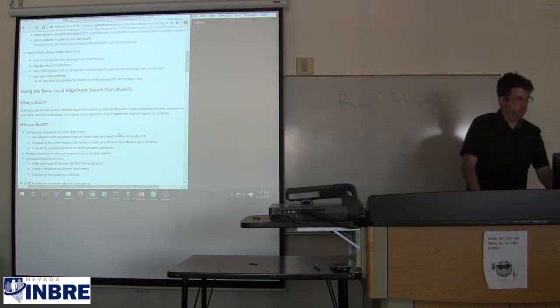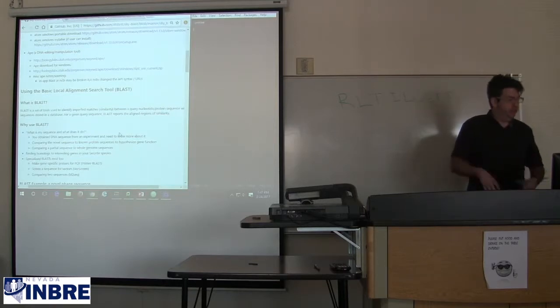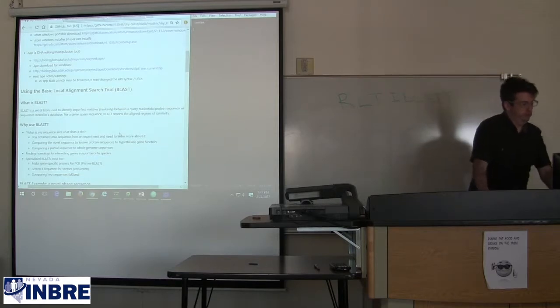All right, so just to recap back to the very beginning, what we're here to do today is to do some BLASTs, and we're gonna try to find perfect and imperfect matches, similarity between a bunch of different queries and a bunch of different databases to try to figure out more about our query sequences, about the things that we're questioning.